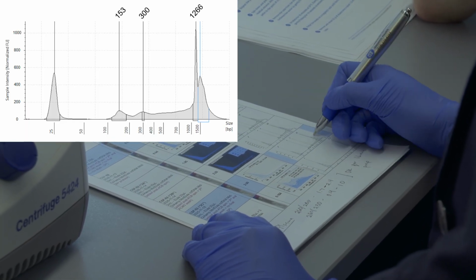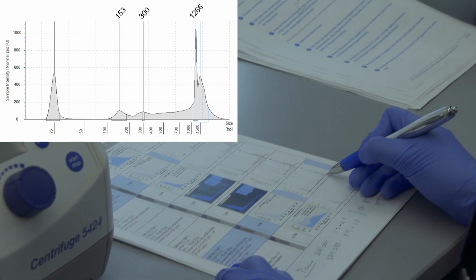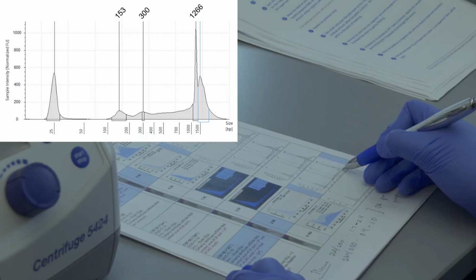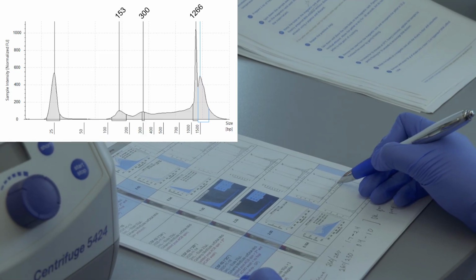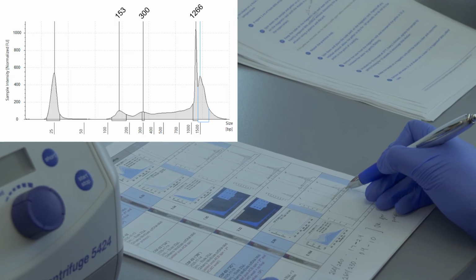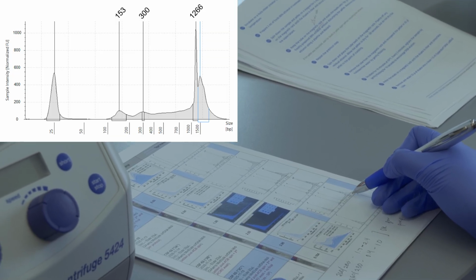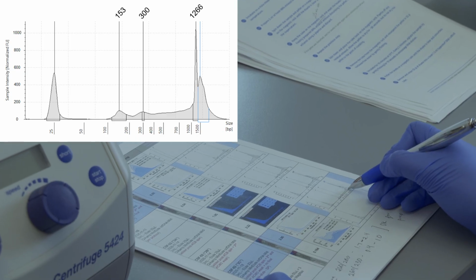Yeah, here we do have, because the problem here is maybe a part of it is the upper marker, right? But still there is some gDNA contamination, but it's hard to say the proportion in terms of number of moles, because it is not resolved here.